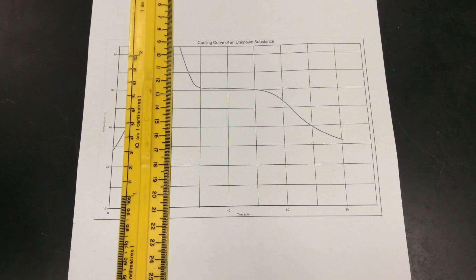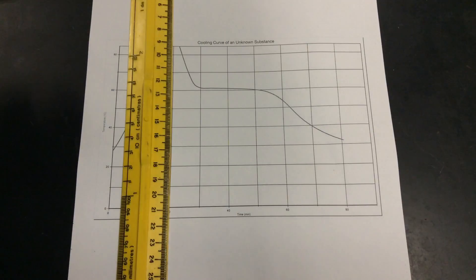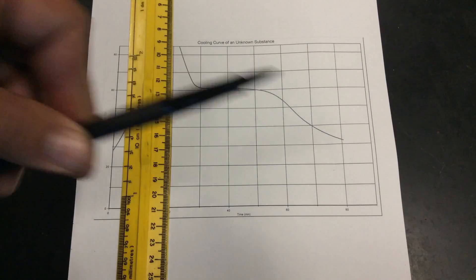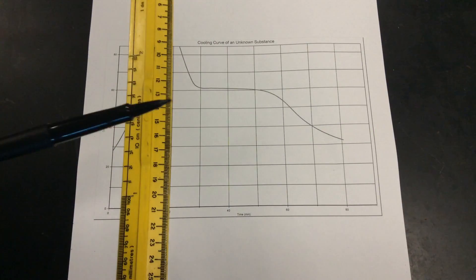Melting and freezing point are the same. What we're going to do is, looking at our cooling part of the curve, I want you to mark up where the solid, liquid, or gas is in the phase change. Obviously, we have solid and liquid phases and we have a phase change and I want you to mark that. Also, I want you to mark on your graph what the actual temperature is.